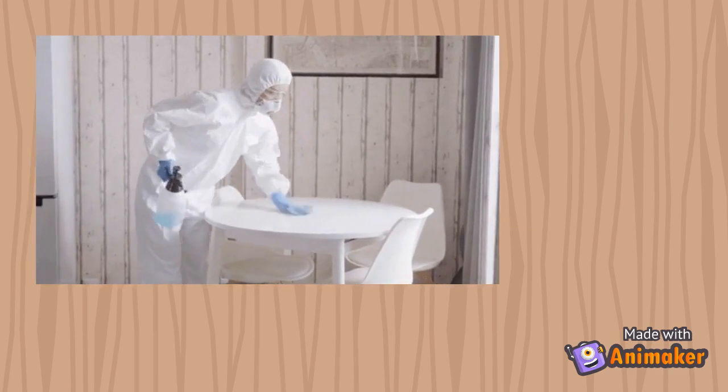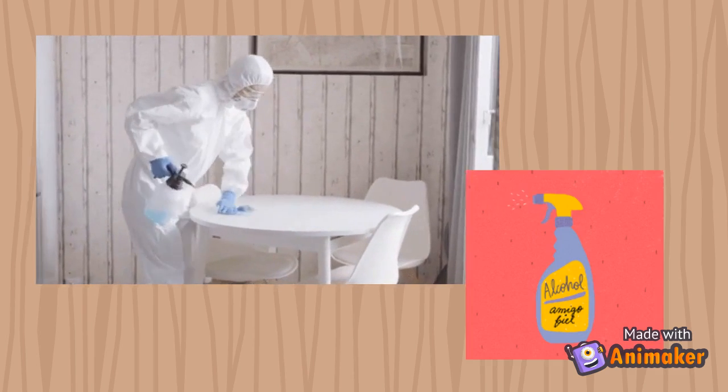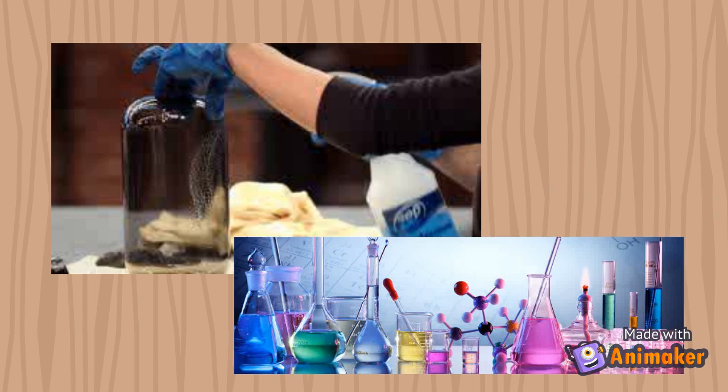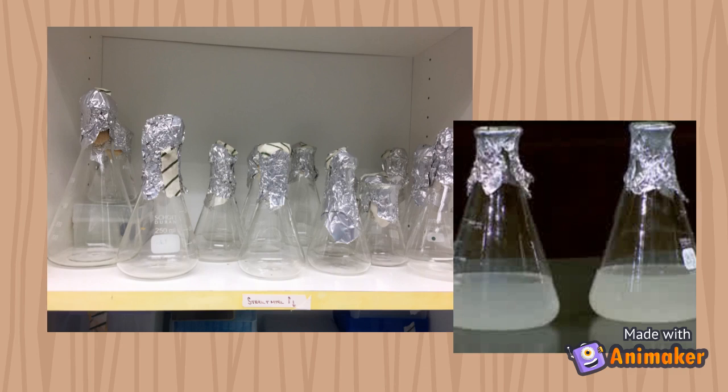Swabbing. Swab down the work surface with 70% alcohol before, during and after work, especially if there is any spillage during the experiment. Swab everything coming from cold storage or a water bath before using it. Capping. Caps should be covered with aluminum foil to protect the neck of the bottle from dust.